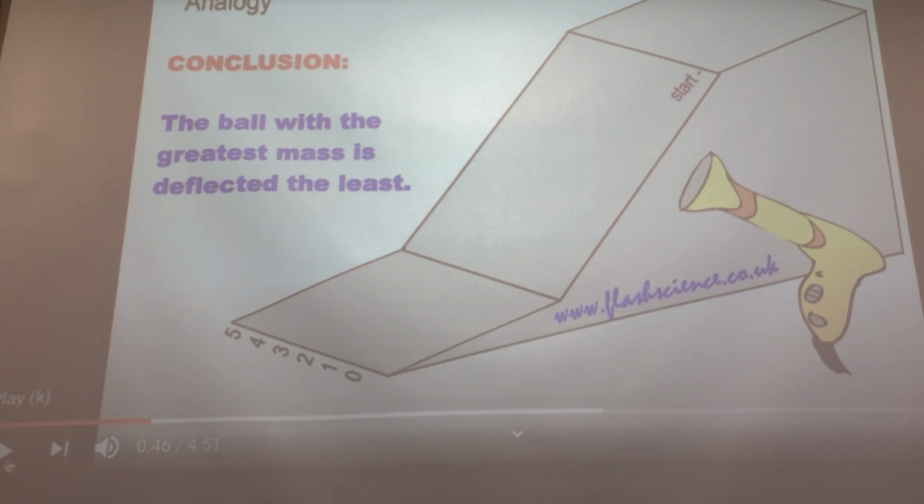Okay, we're now going to watch just a little bit more. It's going to show you an actual mass spec once again in a drawing form, a picture. And then we'll get into dissecting the breakdown of it.